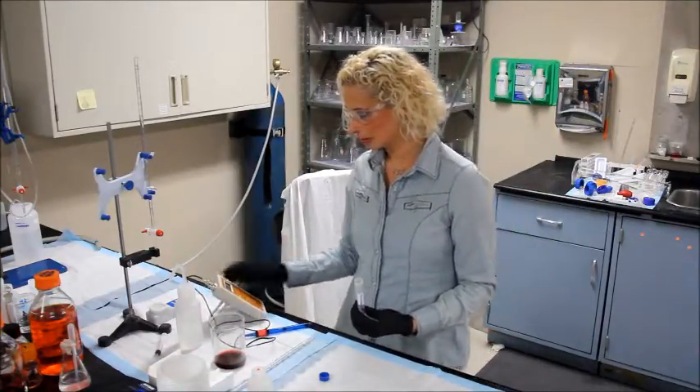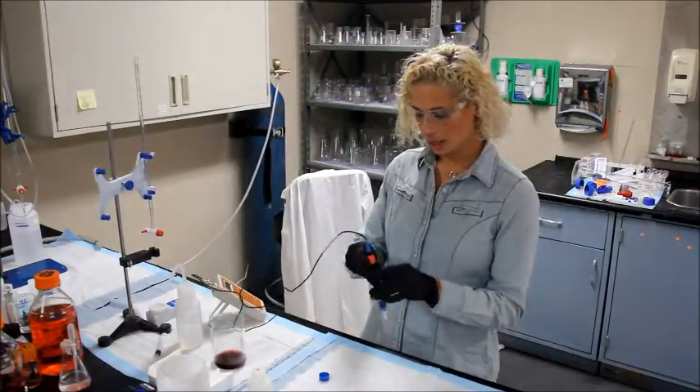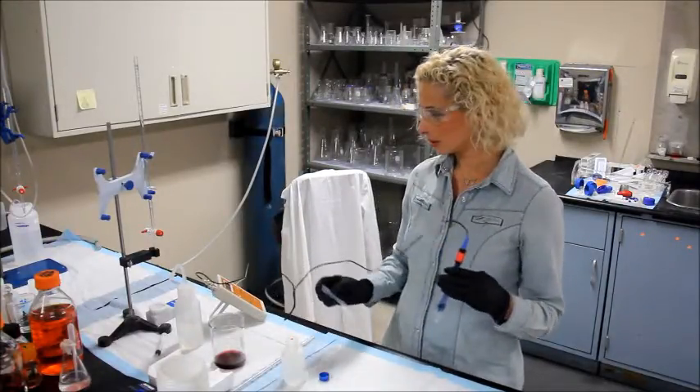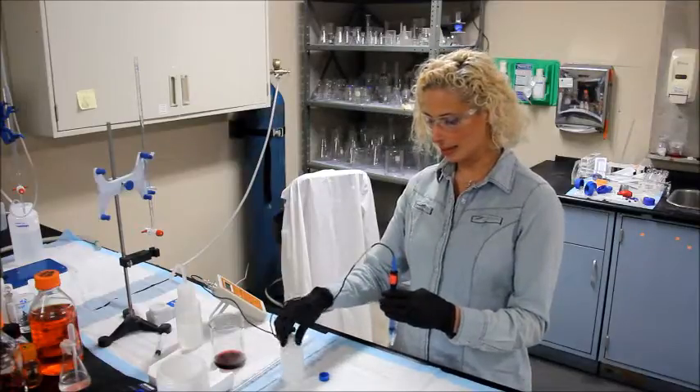You're going to want to pH adjust it with TA titrant using a transfer pipette. You only want to add one drop at a time.